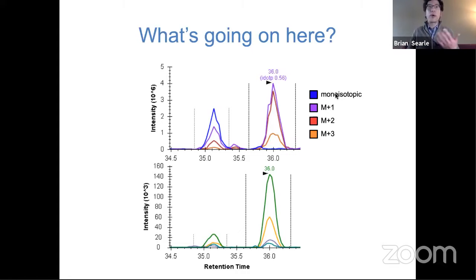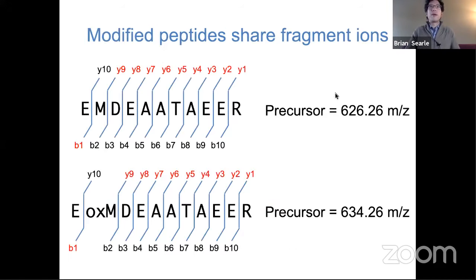And so this is a case where using precursor signal is actually very helpful, but retention time is actually really important in these particular cases because deamidations typically push retention times a little bit further down. A lot of these modified peptides are actually much more complicated than that. Deamidations make sense to be confused because we've confused those before with DDA data here too. But we actually can make very difficult decisions about particular types of peptides where it can be hard to be confident that we're actually making the same types of measurements.